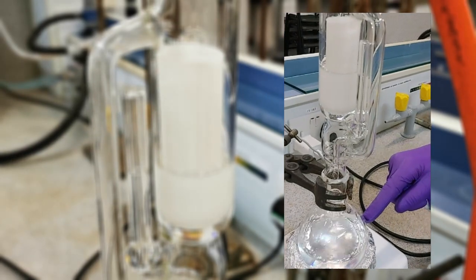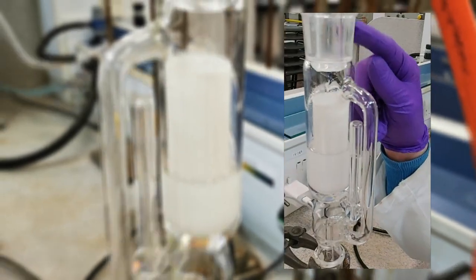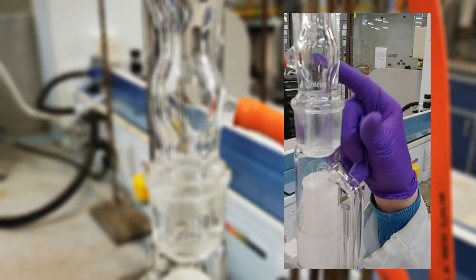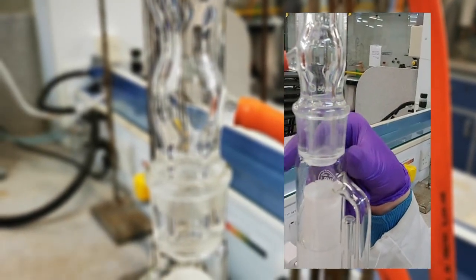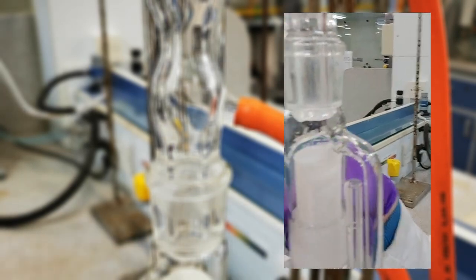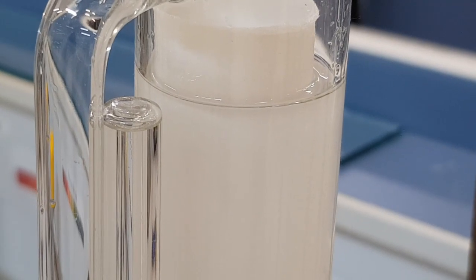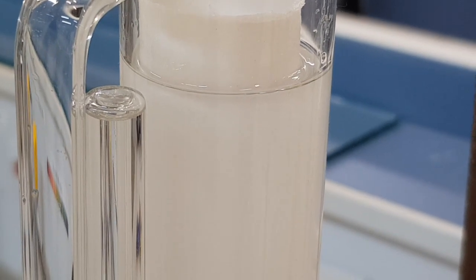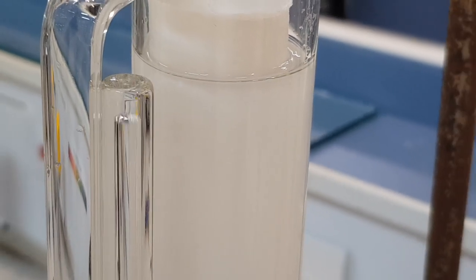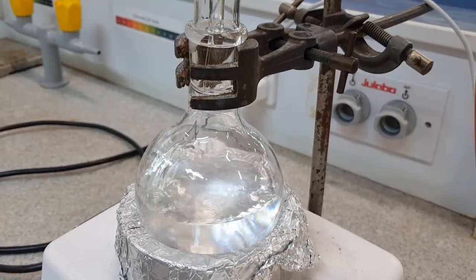So what you can see now is the solvent is boiling, the solvent vapour is travelling up this side arm and it's condensing at the top part of the glassware here, where the bottom part of this condenser is. It's a cold day today, so the condenser isn't really needed. The toluene is condensing here. So the solvent is condensing and the liquid is dripping down into this reservoir here, where we have our cellulose thimble containing the mixture of compounds. Now once the level of the solvent reaches the top of this little sidearm here, the solvent will drain back down into the flask at the bottom, taking with it the soluble component within the mixture and leaving behind the insoluble impurity.